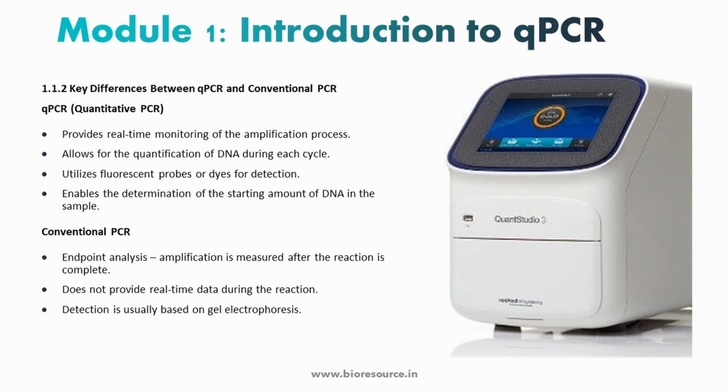You will have to run the PCR product onto a gel to visualize whether the sample has amplified or not. So these are the basic differences between qPCR and the conventional PCR.